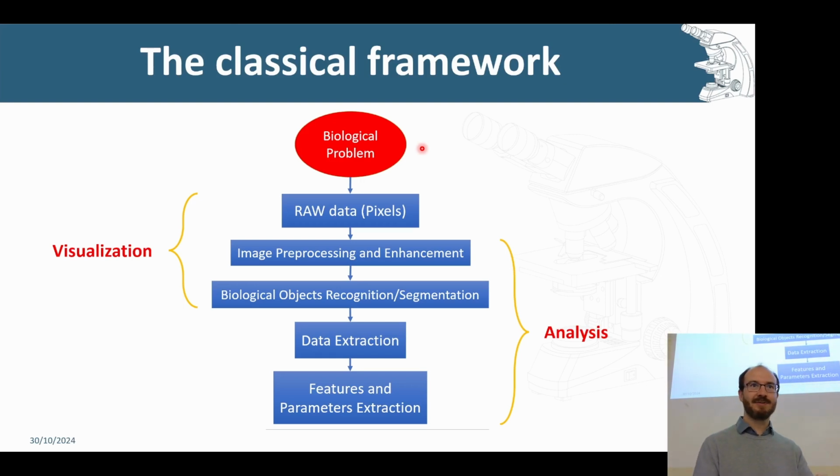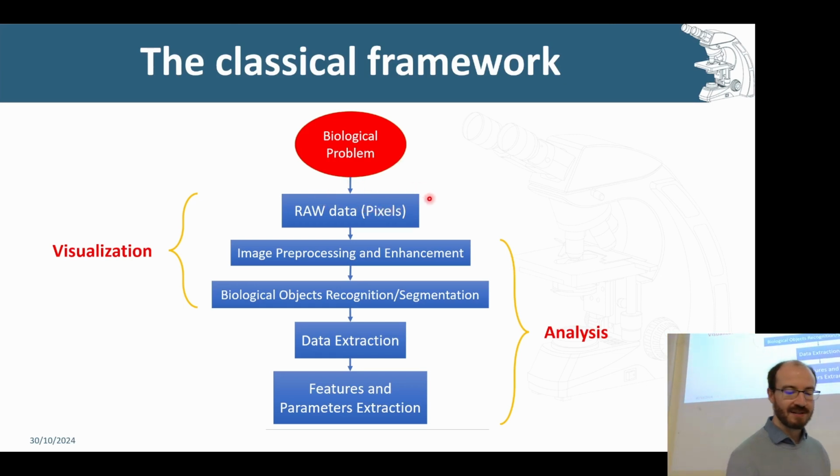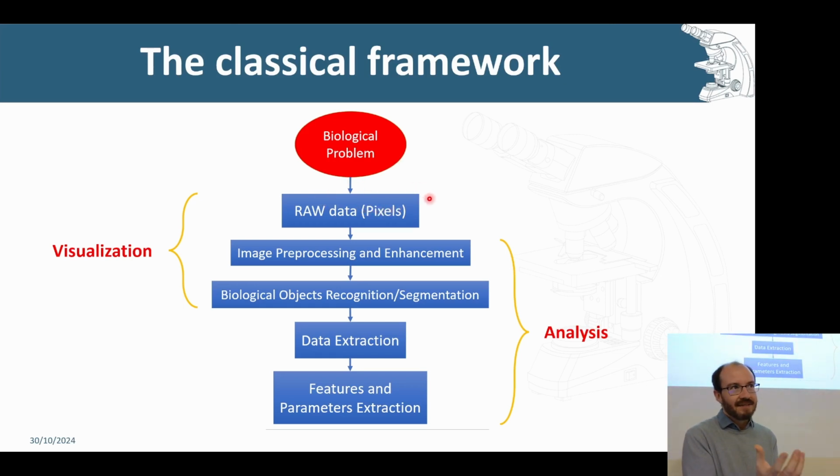So it starts with what is the problem, what is the actual thing I want to quantify or analyze or visualize or whatever, and then you first do a gut feel, you acquire some images with a microscope, and then you say, okay, well, can I with my eyes hint at what I'm trying to get at? Is the information actually there from the raw pixels? And then it's like, okay, it seems like this is reasonable, a microscope has got enough resolving power, all of these things that we require, and now we start with the actual analysis and visualization.